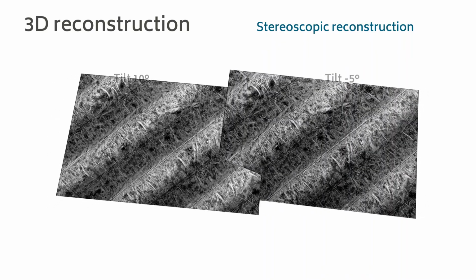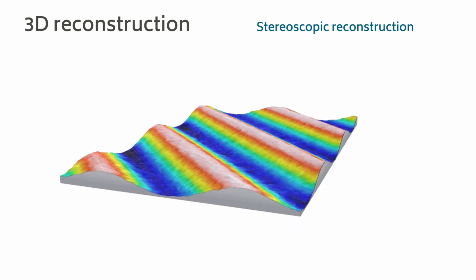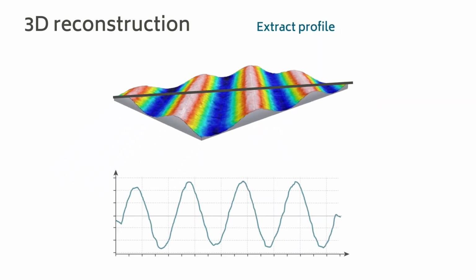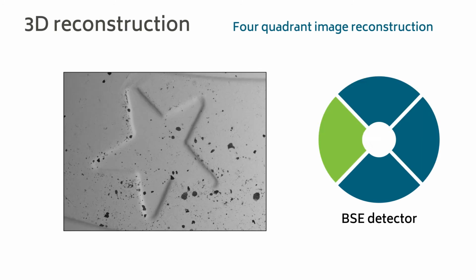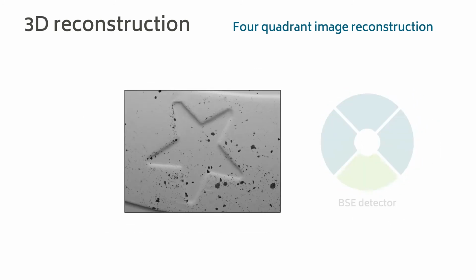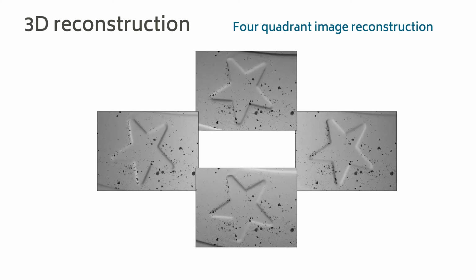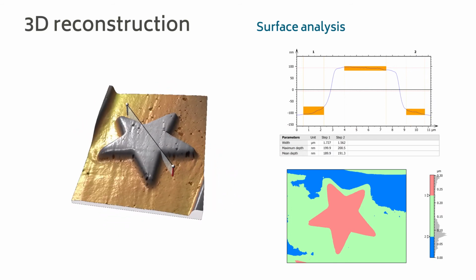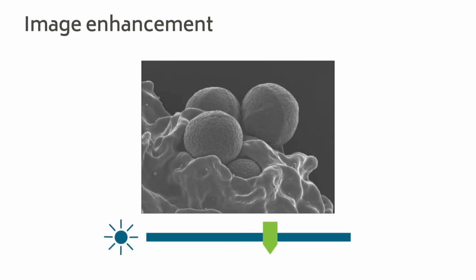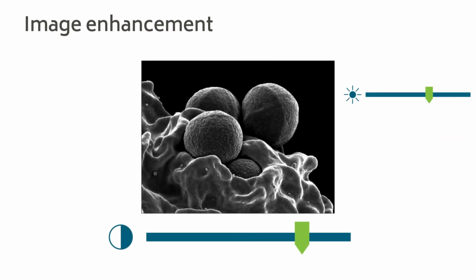So some of the main advantages of using this software is having the actual 3D rendering of two-dimensional scanning electron microscope images. Also, it's very simple to use. It's a powerful software platform that's well accepted in industry for surface roughness measurements.